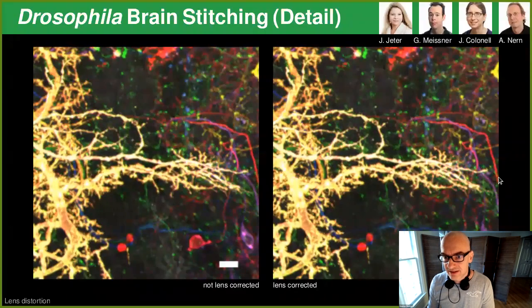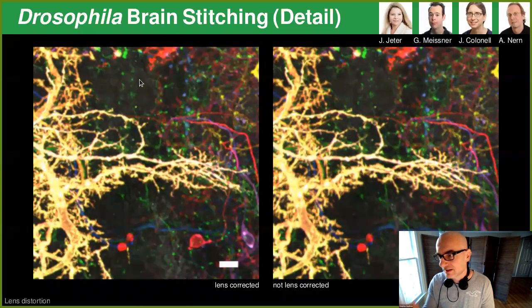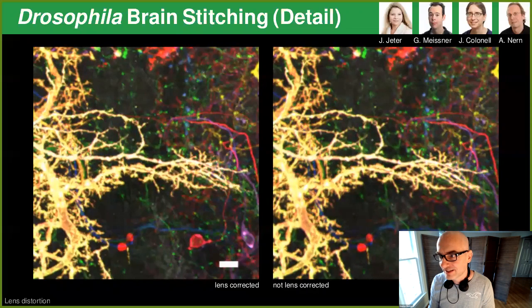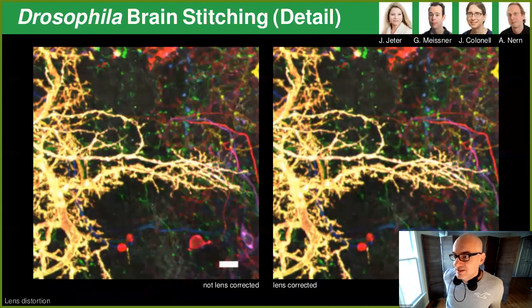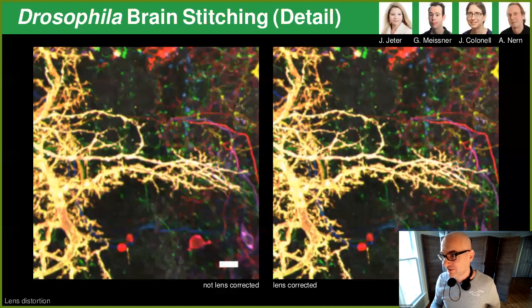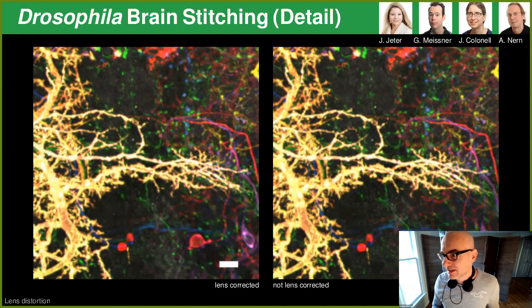And I actually like this example in particular. So if your contrast is correct, you can actually see that this white stuff here, which is the reference channel for synapses, seems to sit stable behind these moving green channels. So we have a little bit of a parallax effect. And this is because we calibrated, so we considered every color channel an independent camera. And we did this multi-camera adjustment that I talked about earlier that we initially developed for the TM microscopes, which now serves the purpose of aligning the different color channels and removing chromatic aberration. So we get an independent lens correction model for all color channels that overlaps these color channels better, and so the co-localization between color channels becomes vastly improved.